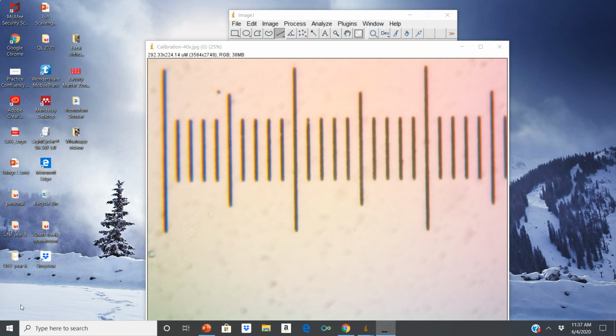In addition, it's helpful to make sure that both of them are at the same size and the same resolution. If not, that can be fixed in a separate step. So that's a separate thing. We will talk about that as well.